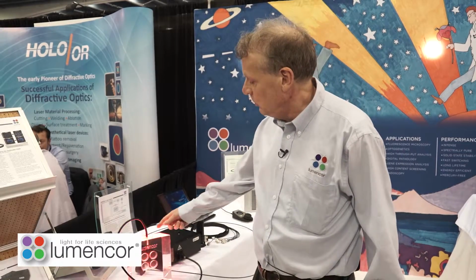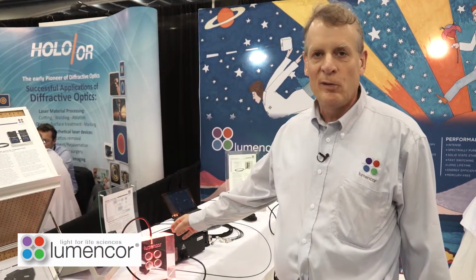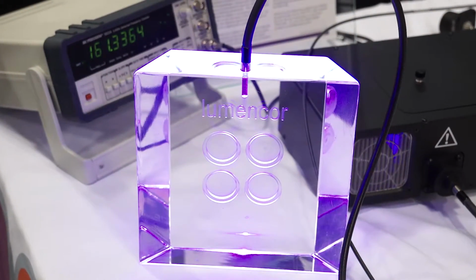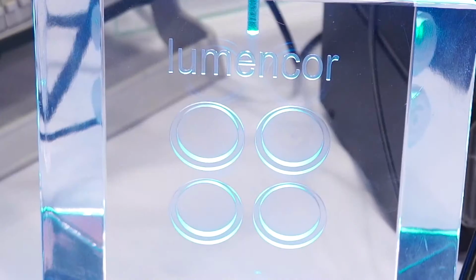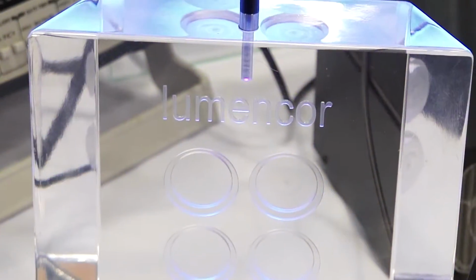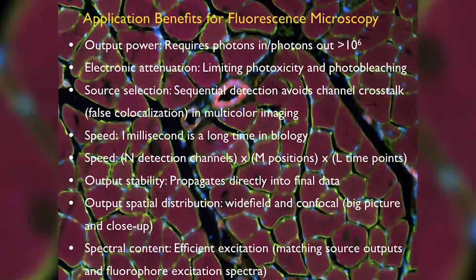As you can see in this demonstration here, each of those six light sources outputs a different color. And the colors together compose the visible spectrum spanning from the violet region, green, blue, through to the red shown there. These light sources can be switched on and off very rapidly for microscopy applications.